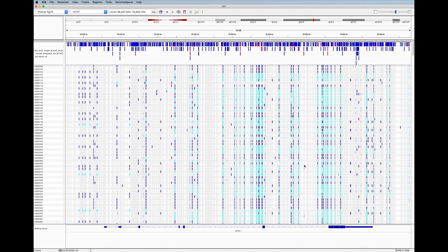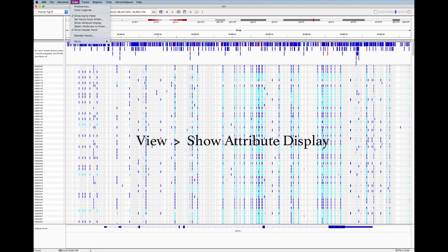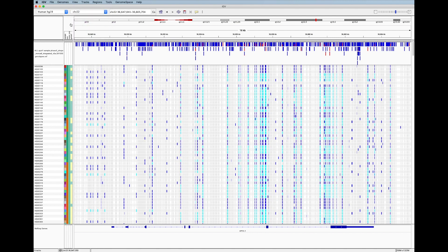And nothing happened. Actually, we need to tell IGV to show the sample annotations we loaded by going to view and selecting show attribute display.